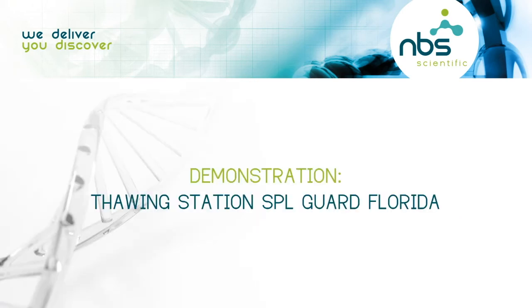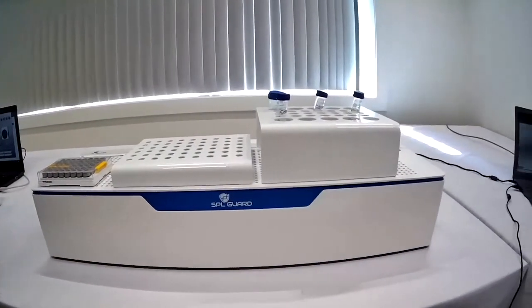And Gracia will demonstrate now the thawing station, the SPL Guard from Florida. Gracia.